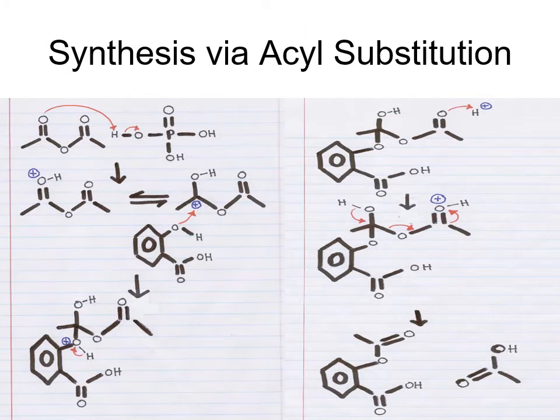So this synthesis is actually not that complicated. You start off with an anhydride here. You'll notice anhydride is anhydro, so that means there's no water. It's very important to know that this is extremely reactive to water. And you'll remember that we are composed of a lot of water, so this is dangerous for us too. That's important to keep in mind.